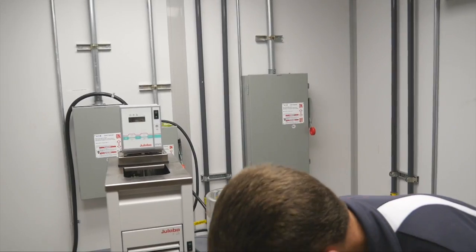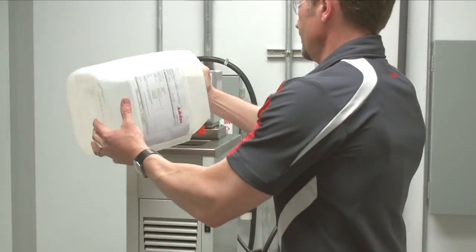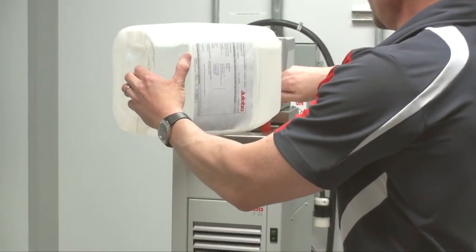Now that the ULABO circulator and external application have been rinsed and dried, we can add our next fluid. In this case I'm going to add some new silicone fluid.